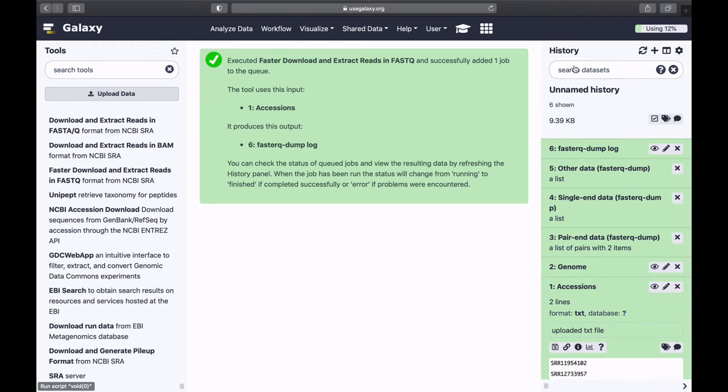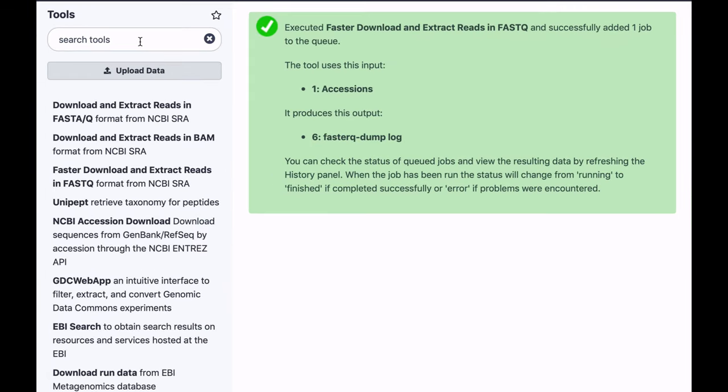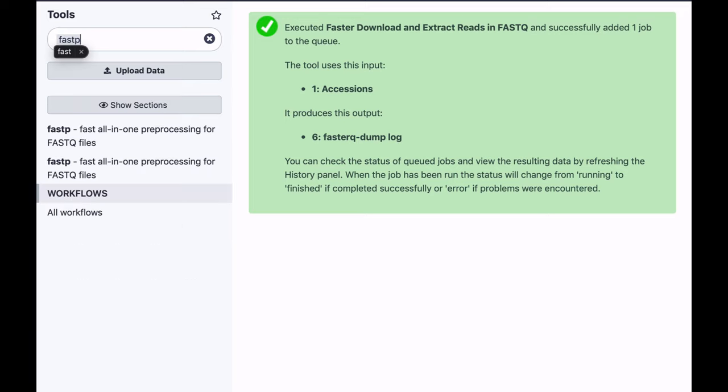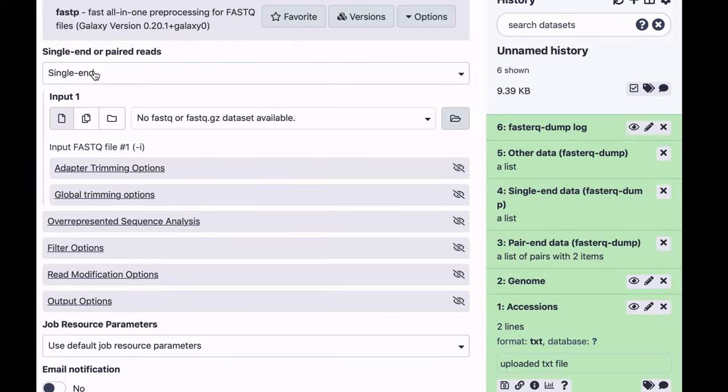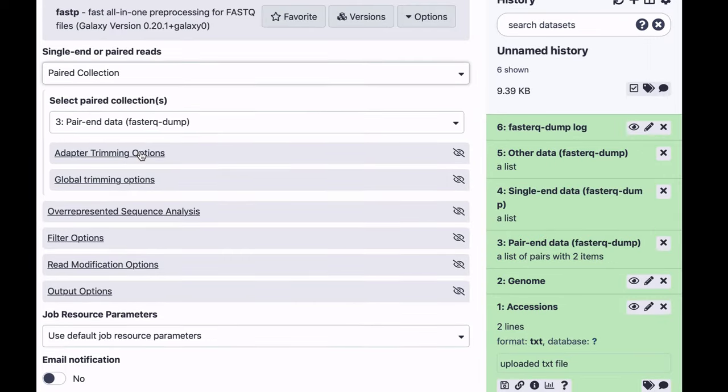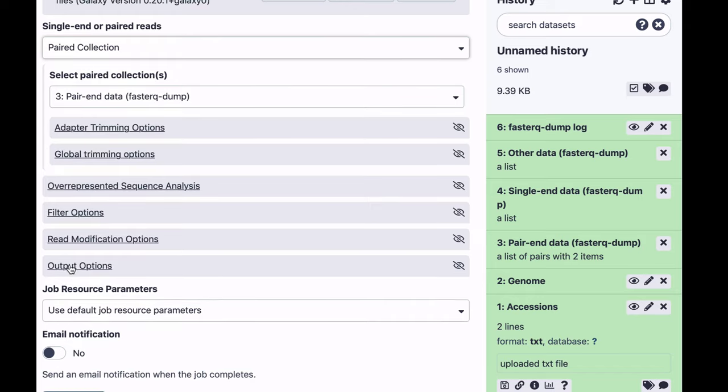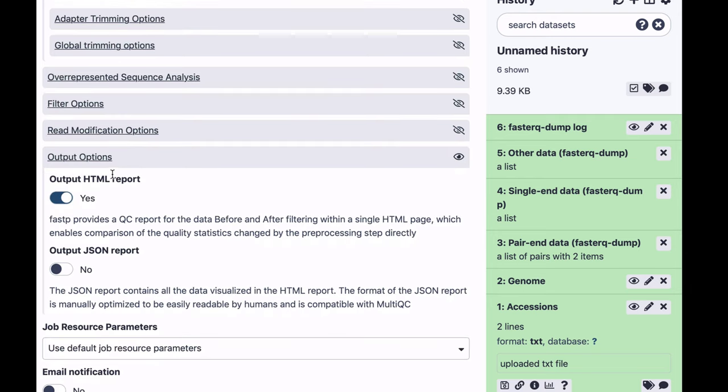So the first thing we're going to do is QC this data using FastP Tool. I'm going to find it here, and we are dealing with a paired-end collection. This is the collection, and the only other thing I'm going to change here is in the output option, I'm going to set output JSON to yes.